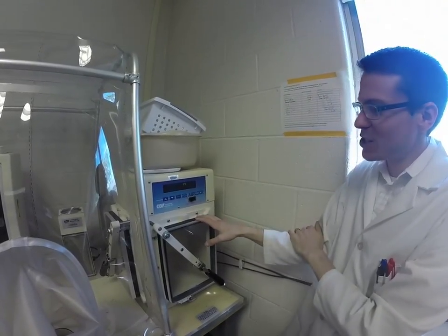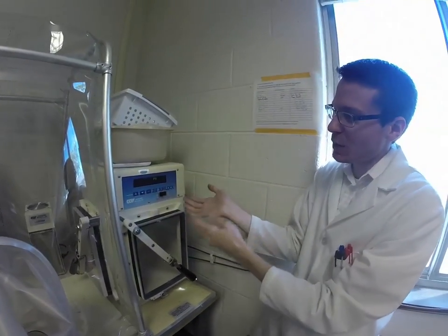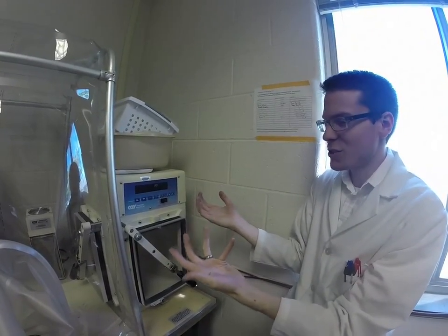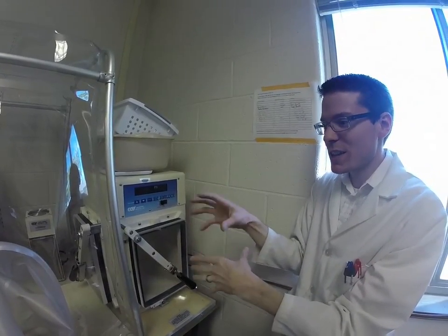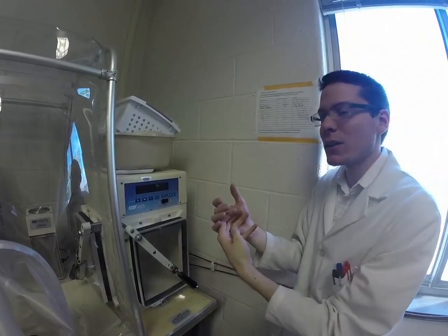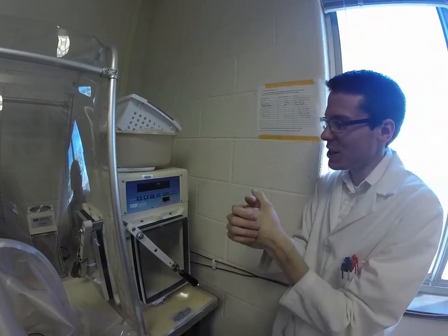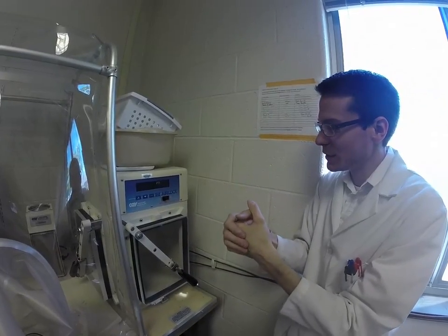A few things to mention are that it does pull a vacuum of 20 inches of mercury, which is fairly significant. So for typical things that are sealed, like media bottles and stuff like that, I will loosen the cap just to allow gas to exchange. It probably helps to remove oxygen as well.